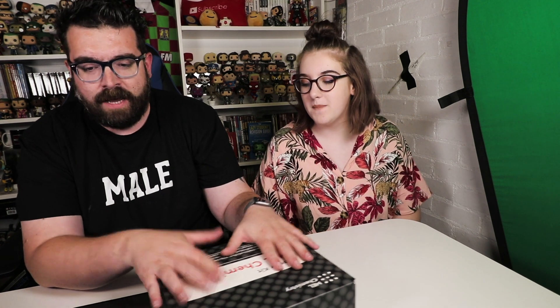They've sent us their chemistry starter kit and we're going to do some science experiments. This is why we've had to come and do it out in the garage. We're not to be trusted in the house doing science, even though these kits are specifically designed for parents to do with their children in the safety and comfort of their own home. Anna has banished us out here to the garage, which, to be honest, it's fair enough. But we're going to have a look to see what comes in a Mel Chemistry starter set.